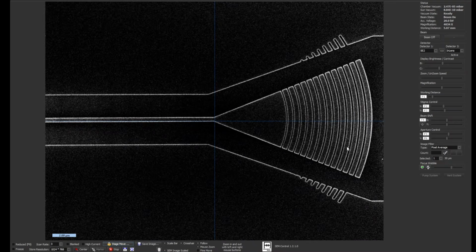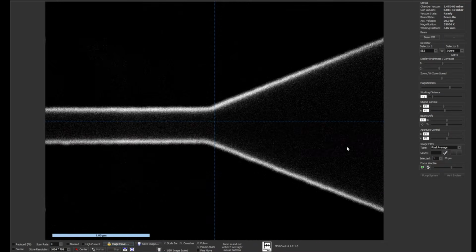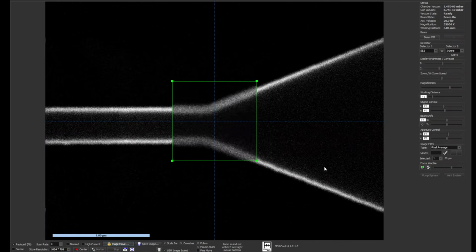I'm using the joystick right now, and I'm going in and make a good image so that we can also use the autofocusing functions by using plane shift. Okay, so this is now the right position. Approximately, the stage has a precision of about 3 micrometers, so I don't need to define it more precisely.